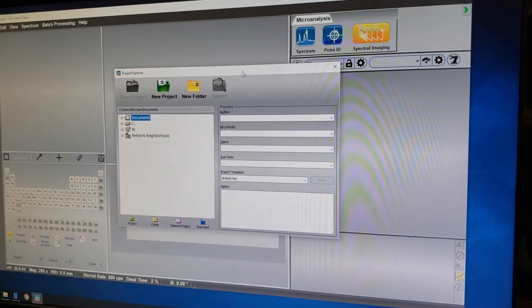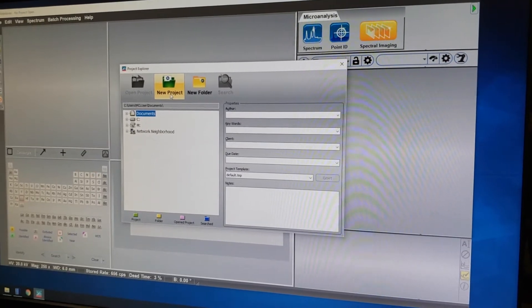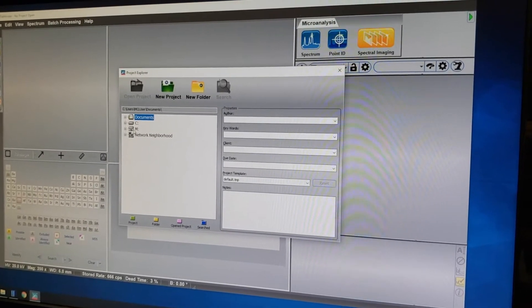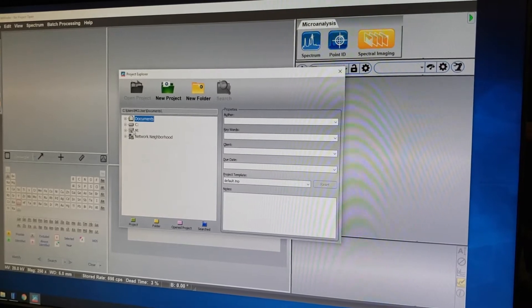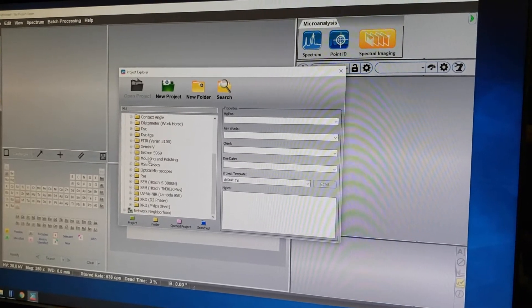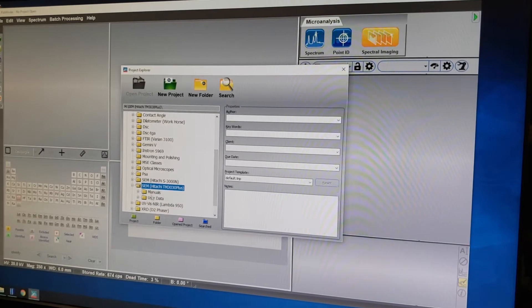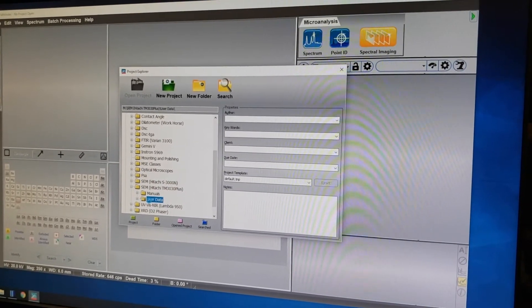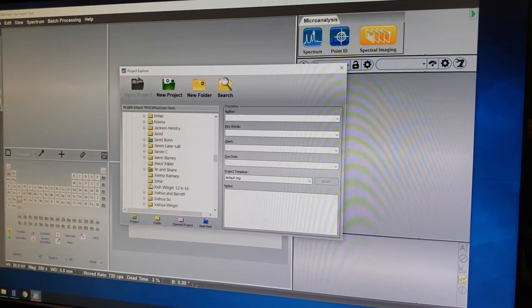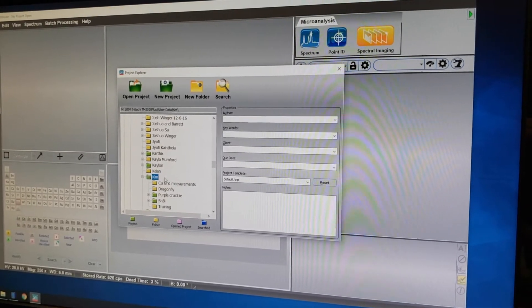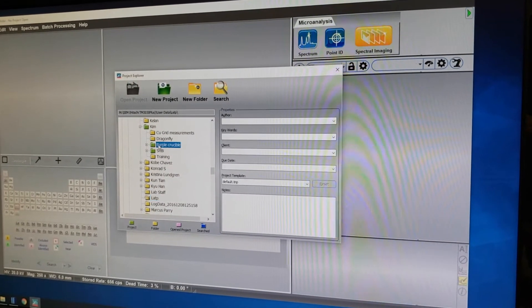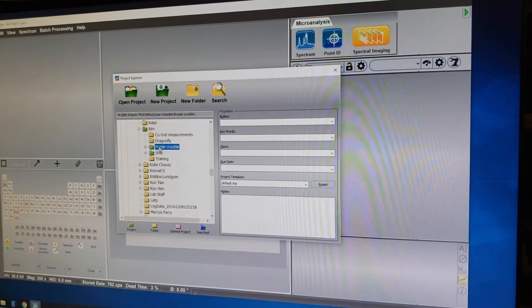Pathfinder is automatically going to ask us to save a project, and it works within a project folder. You create the project folder, and then every image or scan that you take is going to autosave to that folder. If you're logged into the network, that is the M drive here.